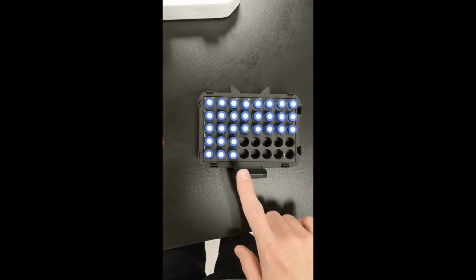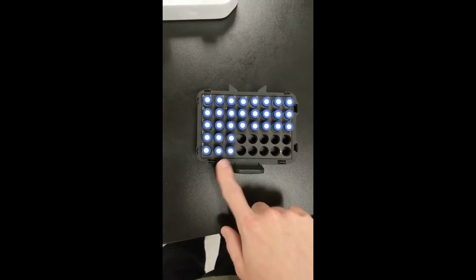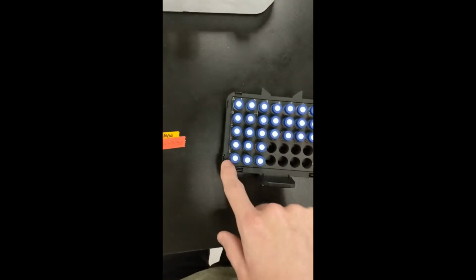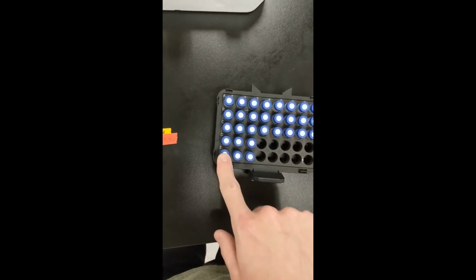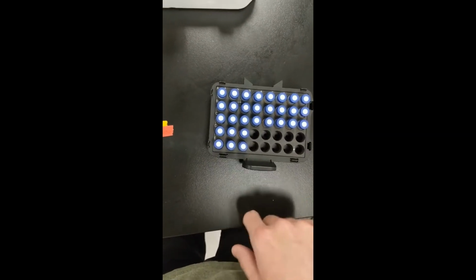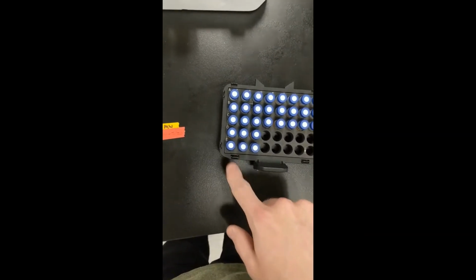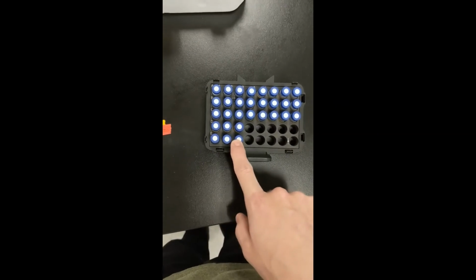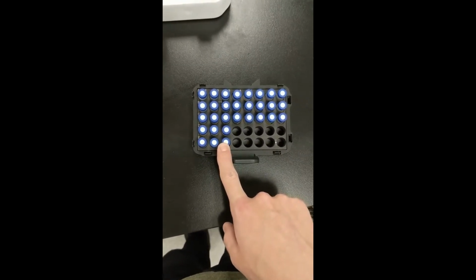So when I input these locations in the instrument, I'm going to have to specify that it's the green tray, it's in row E, and it's in spots 1, 2, and 3. So this is going to be GE1, GE2, and GE3. And we'll have to remember those numbers later for when we're making our run sequence.